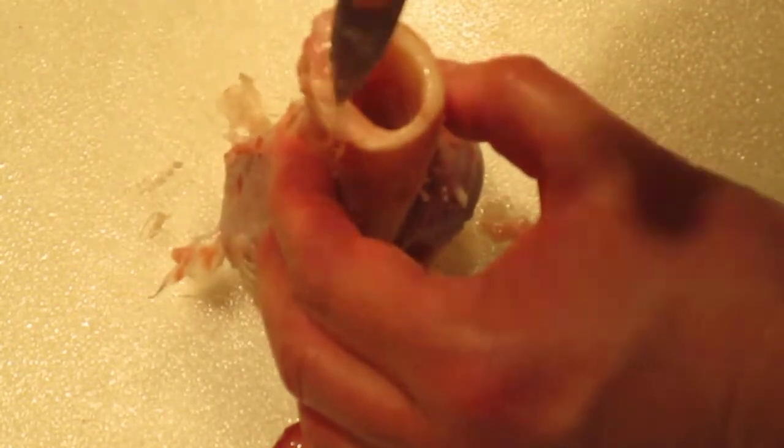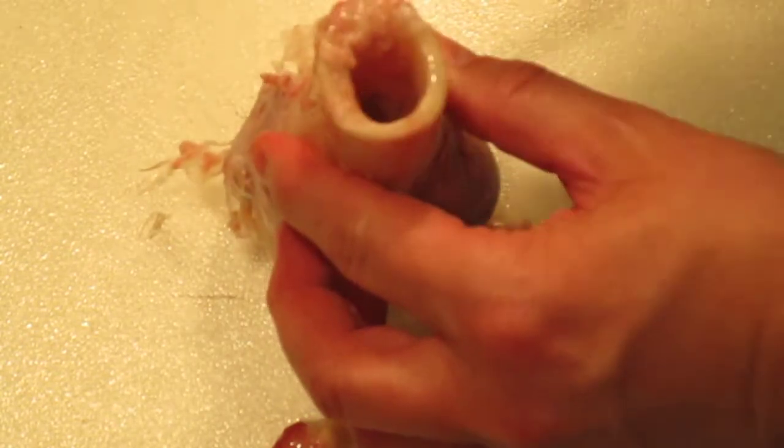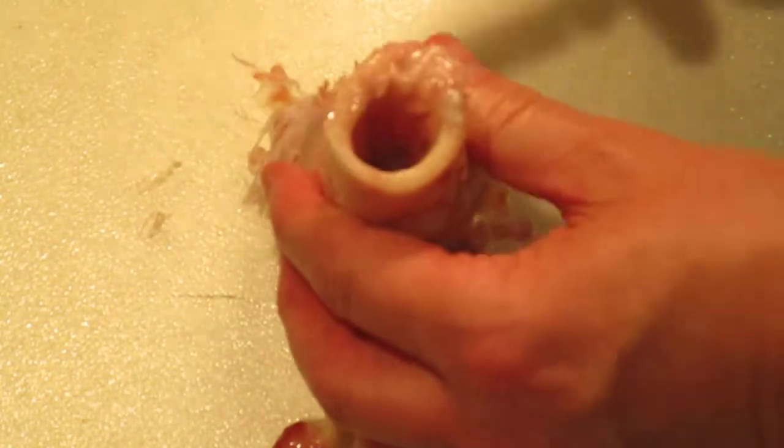The cortical bone is very hard — I'm not making even a dent in that. It's hard to cut; you have to take a saw to cut into this. The cortical bone is very tough.